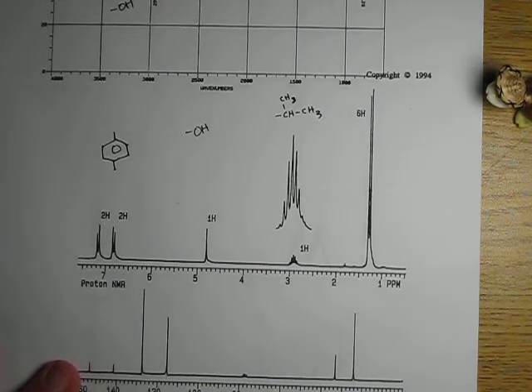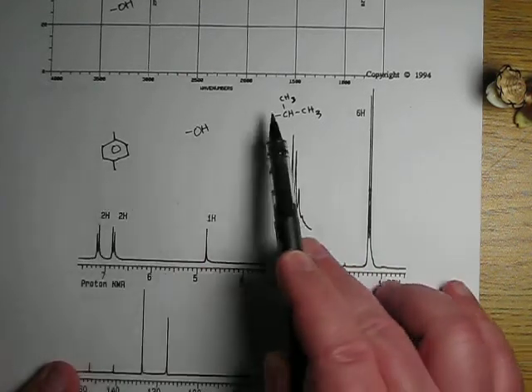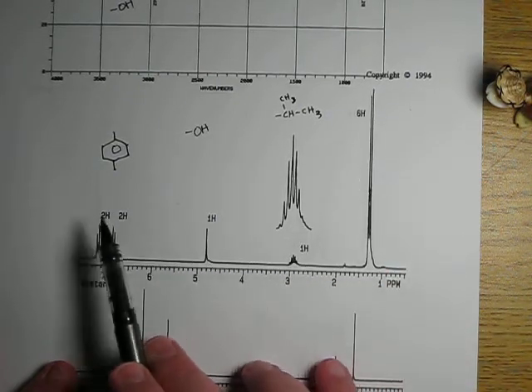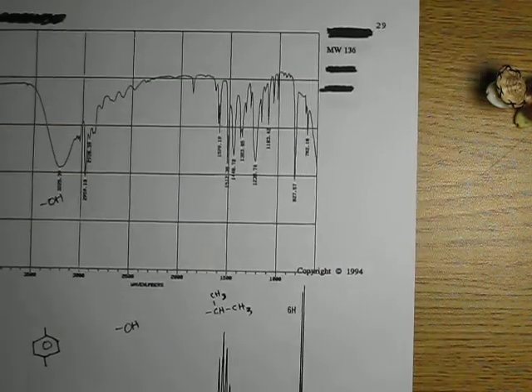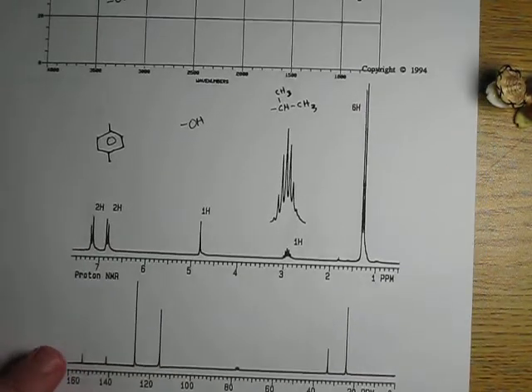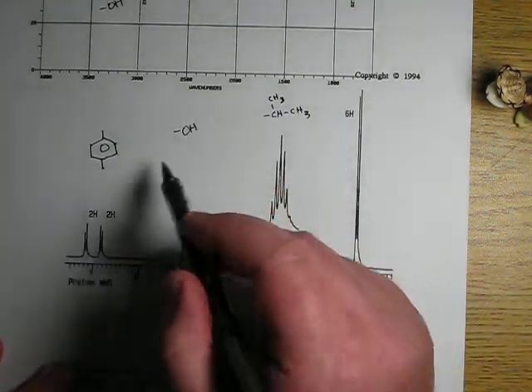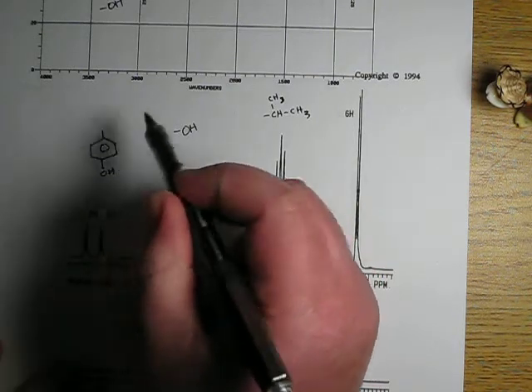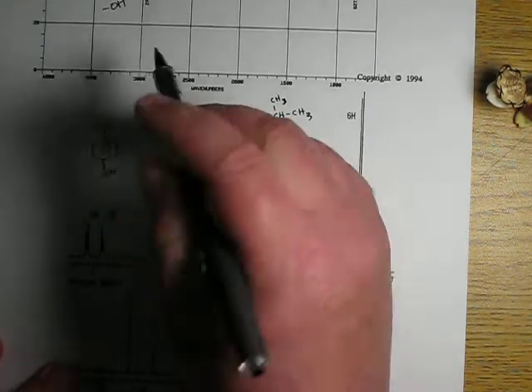Not only that, but look at my pieces parts. Counting my carbons, 1, 2, 3, 4, 5, 6, 7, 8, 9 carbons. Count up my hydrogen, 6, 7, 8, 9, 10, 11, 12, and my oxygen. When I add the masses of all those pieces parts, I get 136. Which tells me I just have to assemble my molecule. I've got these 3 pieces. Well, it becomes obvious now. This OH is on one of the positions on the benzene ring, and the opposite is the isopropyl group.